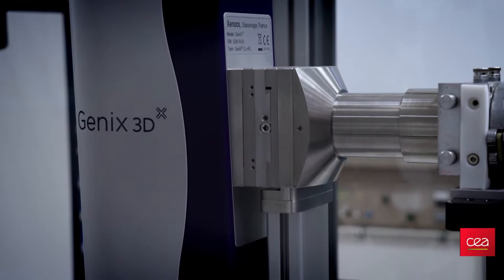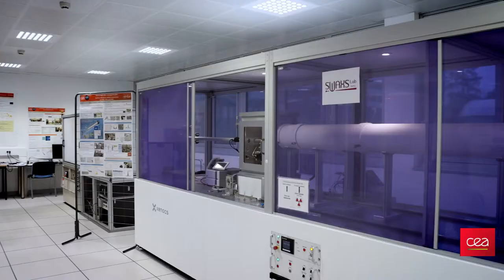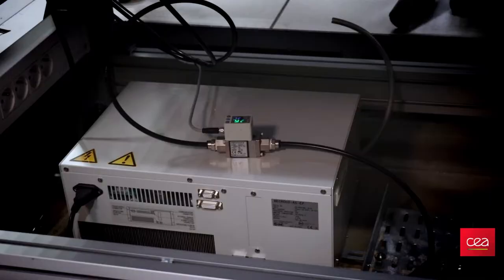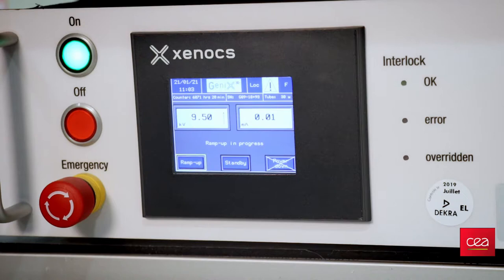The instrument is based on the Genix copper microsource with a high brightness X-ray tube from the Xenocs company. This X-ray generator is very simple to use and similar to the generator from the Xeuss instrument. There is a chiller for the water cooling and a little pump for the vacuum on the generator. After turning on the generator, we just have to wait a few minutes before using it.